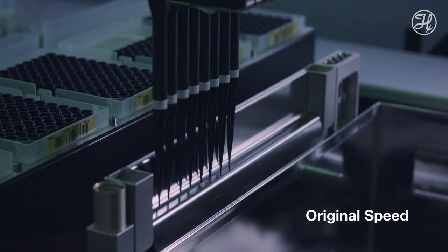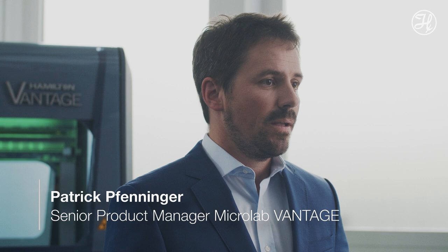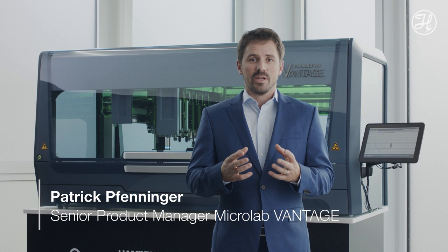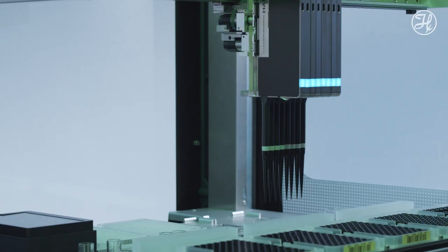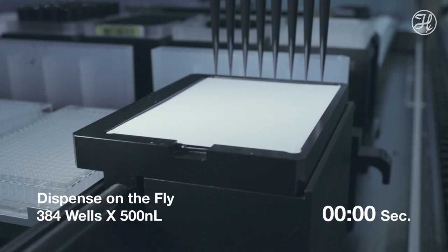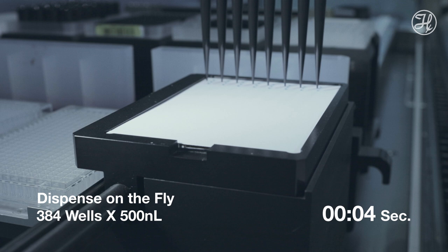The Hamilton MagPIP is comprised of many new features and new technologies. The common denominator in all of these features is speed. To illustrate how fast the MagPIP actually is, let's watch it dispense a 384-well microplate with 500 nL per well. This can be accomplished in under 12 seconds with our new WIP-PIP pipetting technology and serpentine dispense on the fly.